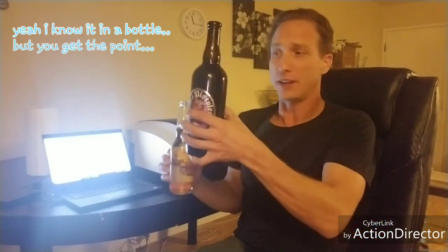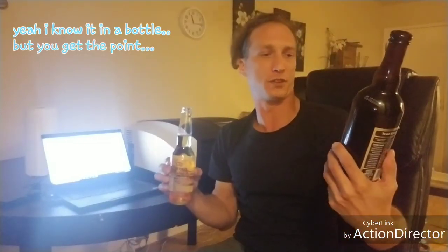You can easily see that if you look through a bottle of beer like a Corona, it's a lot lighter and a lot different color than a beer like Trois Pistoles, which is going to be a lot darker. It's going to absorb different colors. So these are all going to have slightly different spectrums. And that's something that you have to actually just account for in your measurements. I'm not going to be able to compare a Corona to, you know, a Fin de Monde or an IPA.